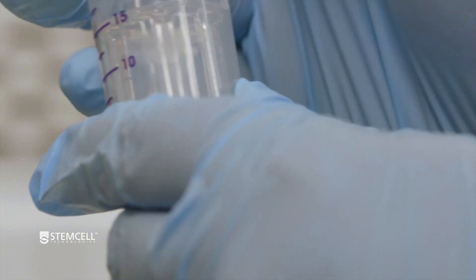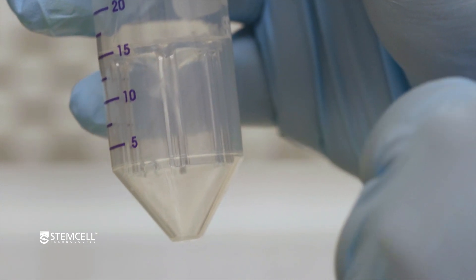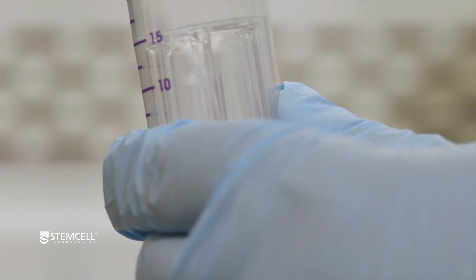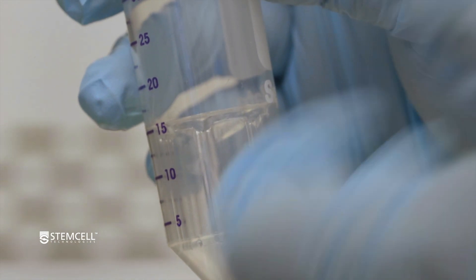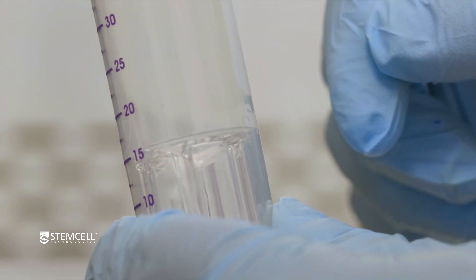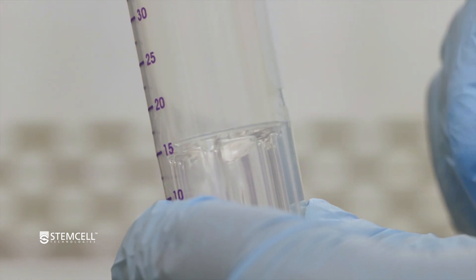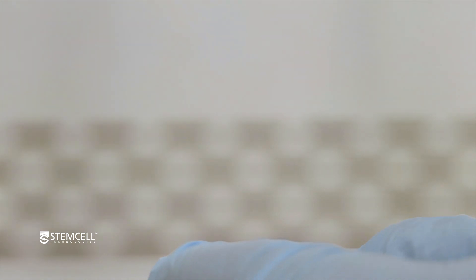CEPMATE is a unique product from Stem Cell Technologies that has a plastic insert inside a 50 ml tube. This insert allows density media, such as lymphoprep or FICOL, to be dispensed through the center aperture. Once prepared, you can dispense diluted whole blood through the top, then spin it in the centrifuge with the brake on, and pour out your PBMCs.